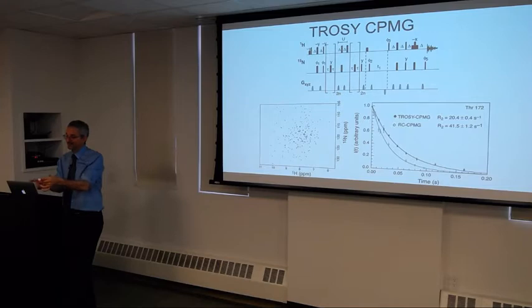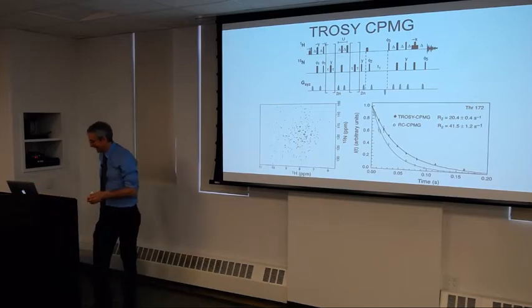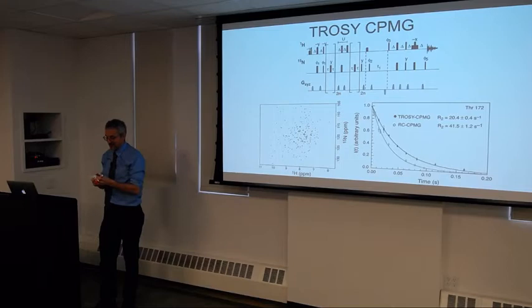To become non-secular, we have to let the two operators become anti-parallel to each other. But if we're pulsing quickly, they never dephase like that. So now the broad line and the narrow line start to cross-relax. They cross-relax with 1/2 of the remote proton R1. It's the same relaxation matrix, we're just thinking of it differently.